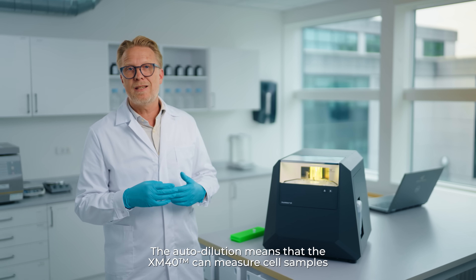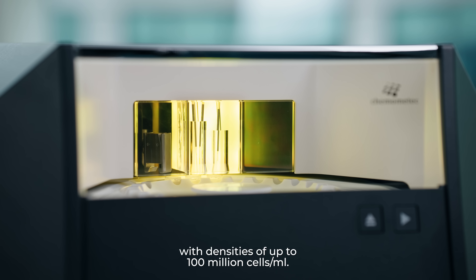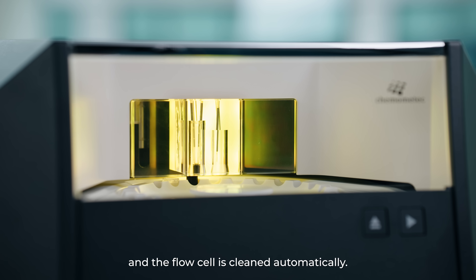The autodilution means that the XM40 can measure cell samples with densities of up to 100 million cells per ml. After analysis, the sample is removed and the flow cell is cleaned automatically.